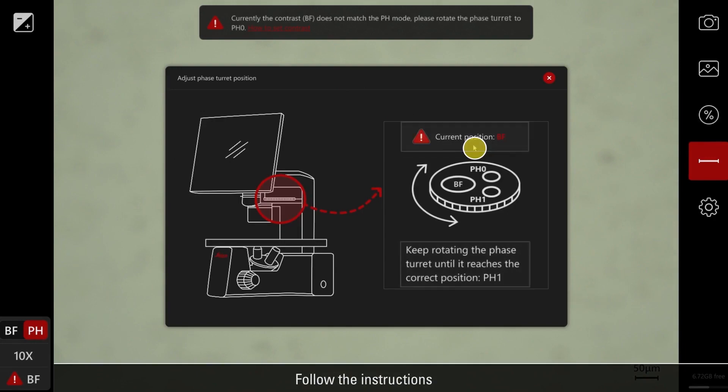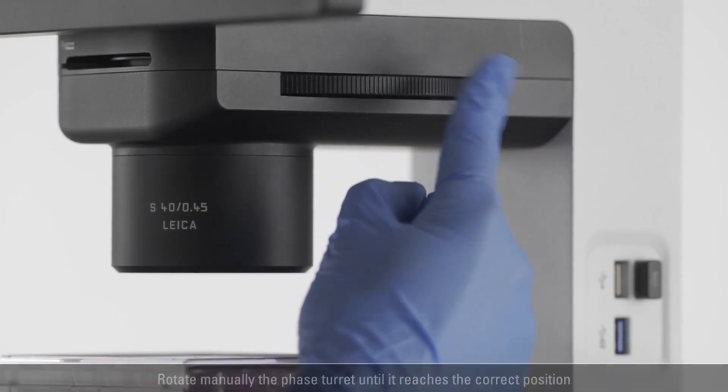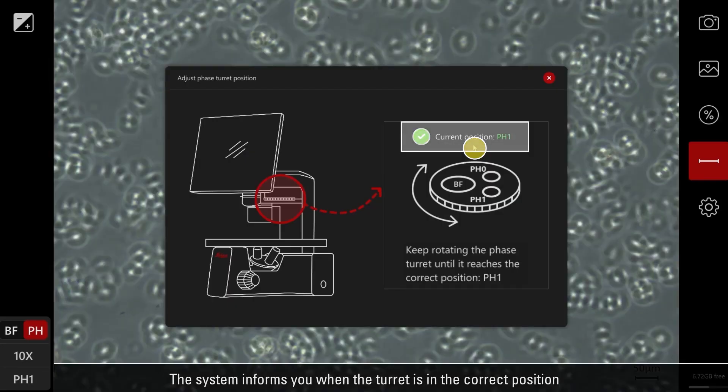Follow the instructions. Rotate manually the phase turret until it reaches the correct position. The system informs you when the turret is in the correct position.